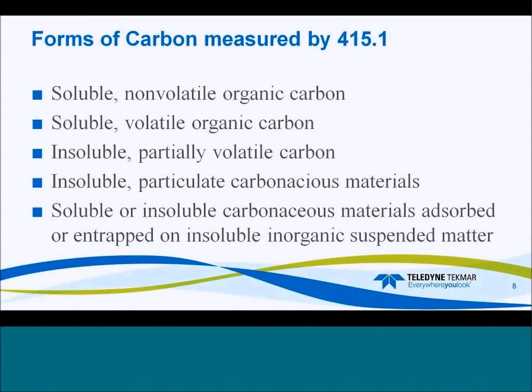So if you're storing samples, it's important to remember some things. First of all, if you can store it in glass, it's always preferable. Plastic is not as ideal. And if you're preserving your samples for more than 2 hours, you should preserve with acid. Store your samples in a cool area, away from sunlight and atmospheric oxygen, so that everything is preserved as they are.